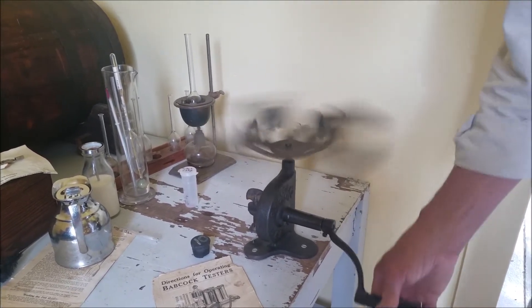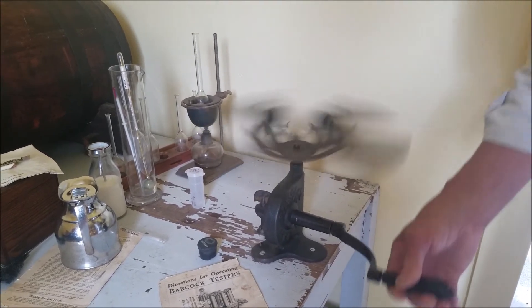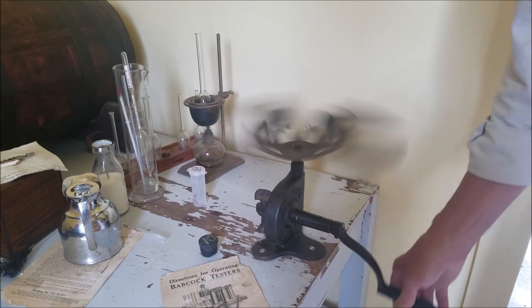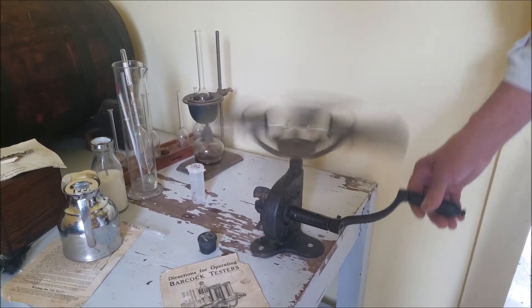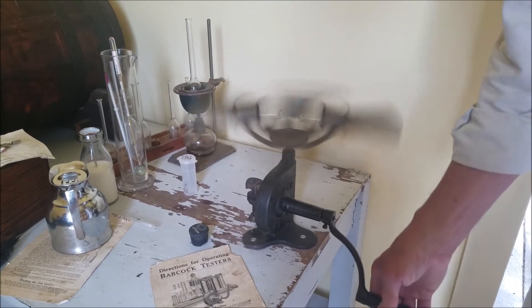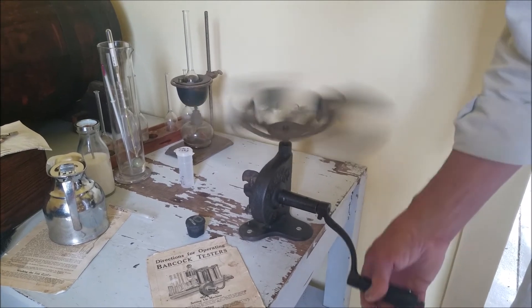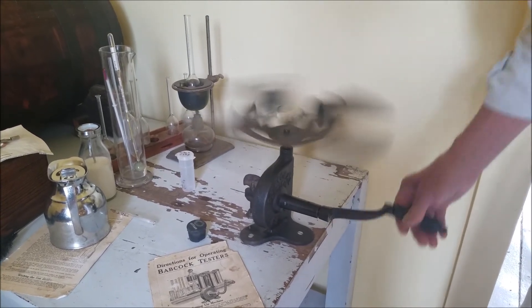The result will be in percentage — something like 3.2 or 3.3 percent. Take that times the pounds of milk that the farmer has, and that'll give you the pounds of butter fat. And that factory can pay based on the butter fat and the weight of the milk.